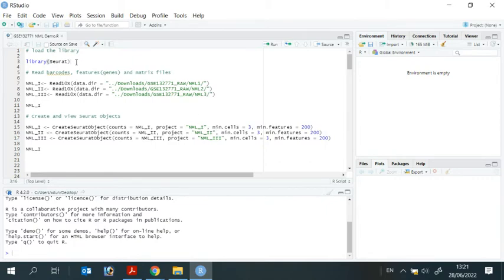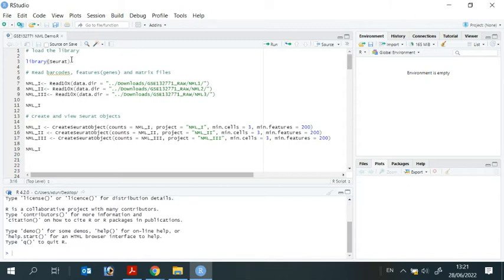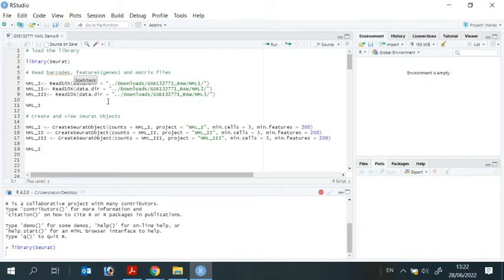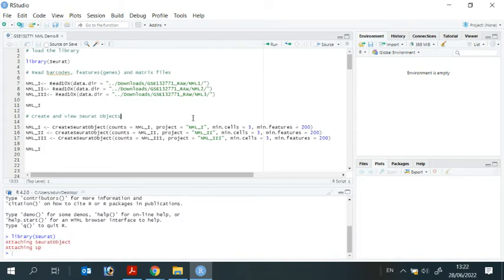But I installed it already. So I just need to load it. For the demonstration, we are going to run the code line by line. You can just put your mouse here and then press run. So R will load the Seurat package. Yeah, it is ready.